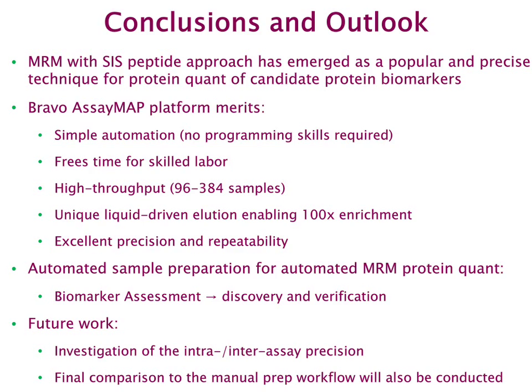Remaining future experiments to be performed include a more rigorous investigation into the inter-assay precision with standard curves and individual samples prepared and processed on different days by different operators. Such work is being planned together with the Proteomics Center of the University of Victoria, and the final comparison to the manual prep workflow will also be conducted and presented.